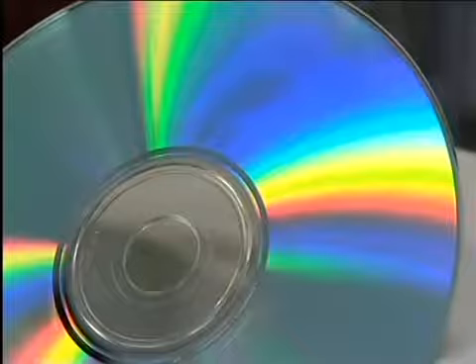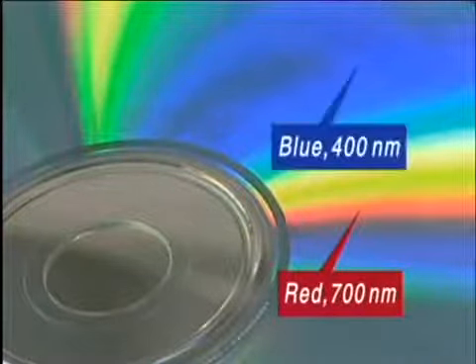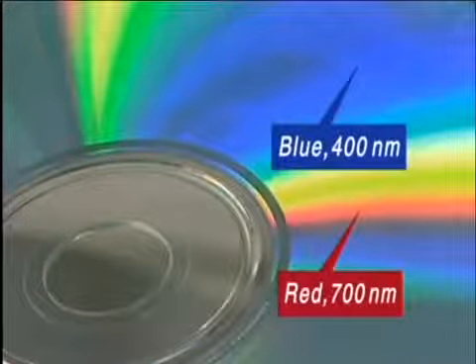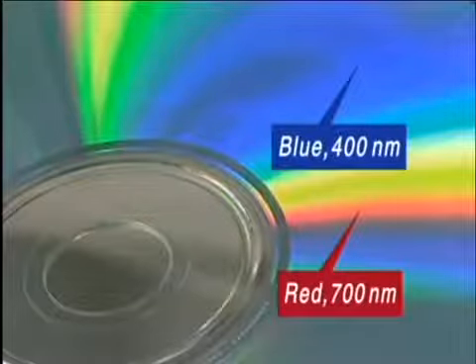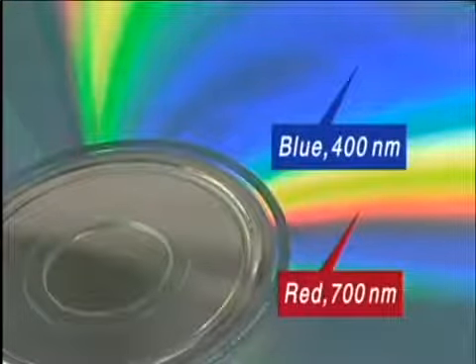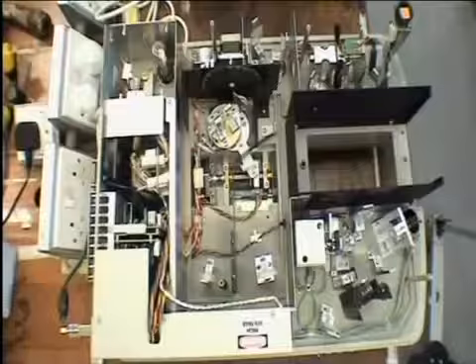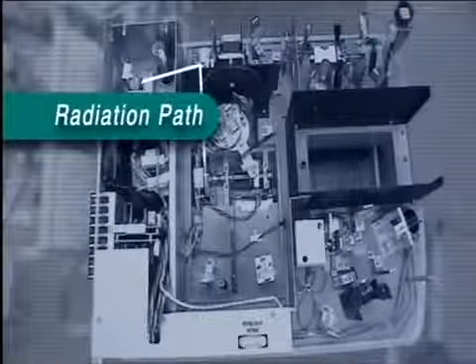Different wavelengths correspond to different colours. Red is about 700 nanometers and blue around 400 nanometers. Wavelengths shorter than about 350 nanometers are called ultraviolet. Shorter wavelength light has higher energy. The source produces white light that includes all wavelengths, all colours.